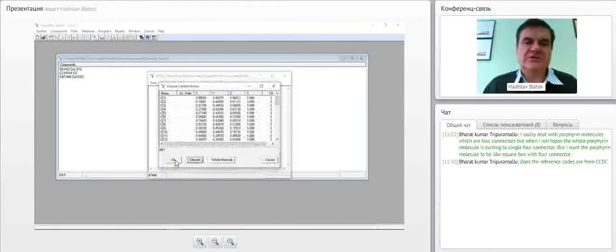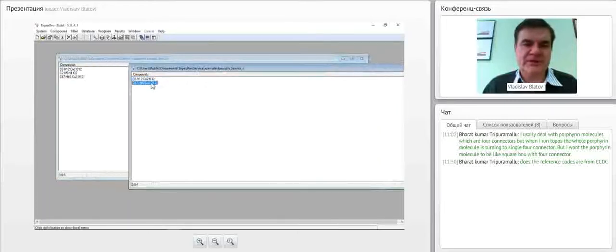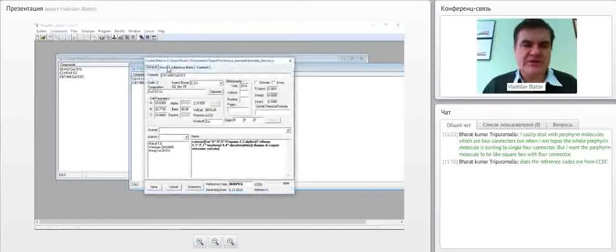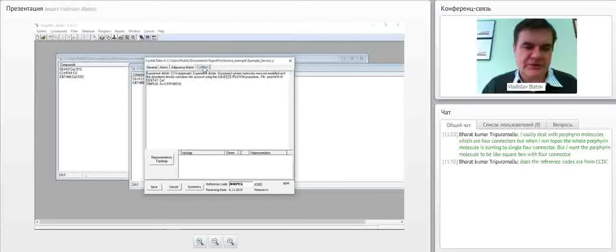Let's look at the list. We have here copper atoms, oxygen atoms, terminal really with coordination number 1, and pseudo-scandium atoms that are the centers of organic ligands. I simplify this structure more with the simplified adjacency matrix procedure.